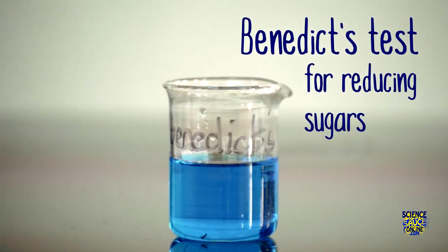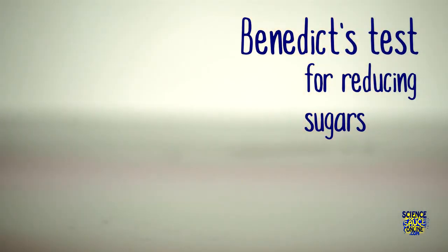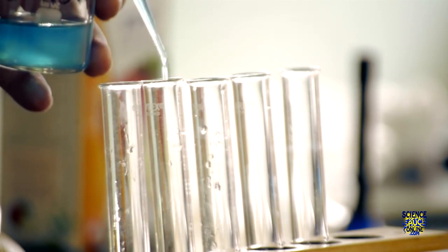The Benedict's test is the test for reducing sugars. Glucose is an example of a reducing sugar. First, you take your Benedict's reagent and you add it dropwise to each of your samples.